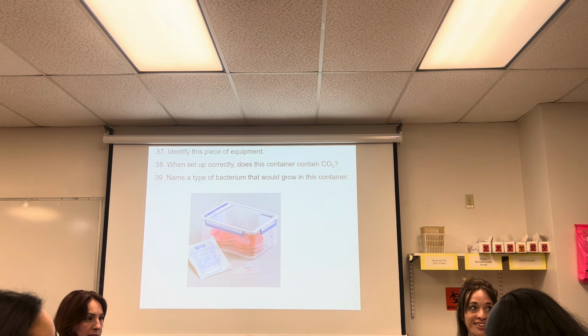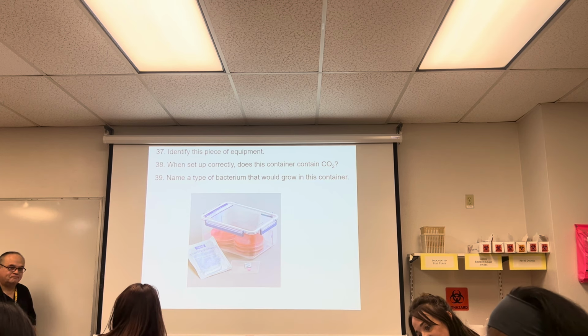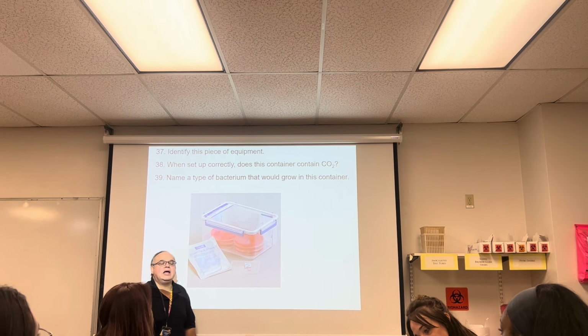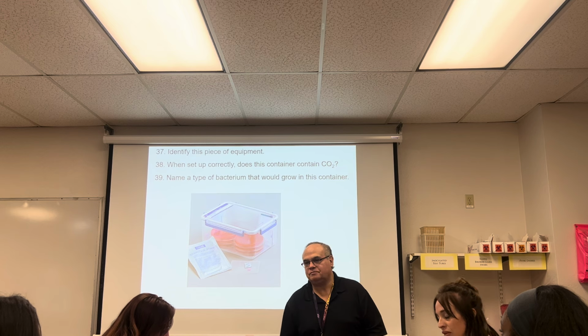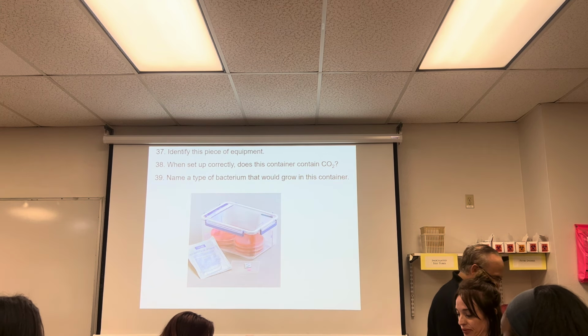I know, you guys are like, I'm taking statistics, that's the null hypothesis. In microbiology, this means anaerobe, and F in front of it means facultatively anaerobic. Okay? What that means is it can live with or without oxygen, but it prefers oxygen. Aerotolerant. I am saying facultative. It's not like faculty. Okay? All right, here we go.